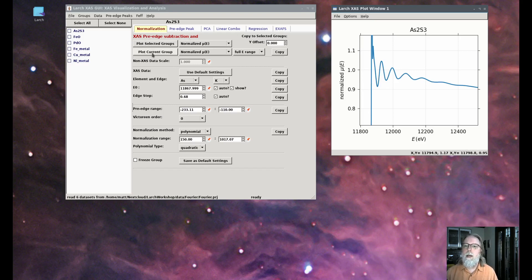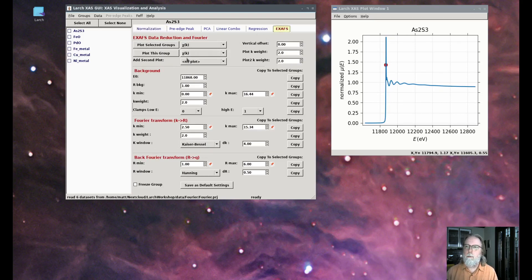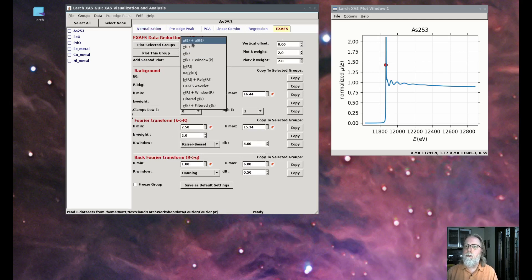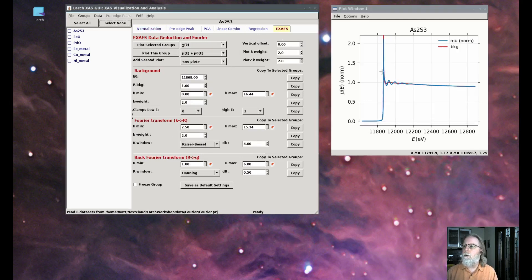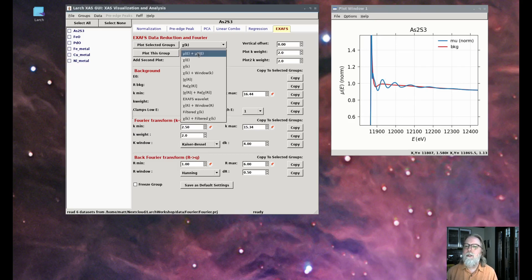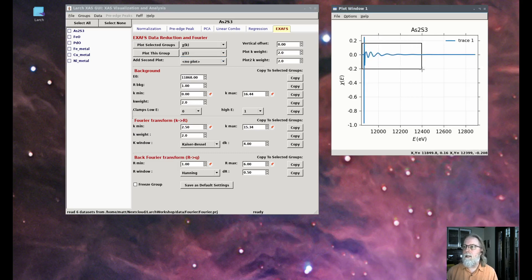Now that we have the data and it's pretty well normalized, we can go over to the XAFS tab where we'll work to do background subtraction and Fourier transforms. From here, we can look at the background subtraction. We'll show mu of E and the background that we would subtract. We're going to subtract the background curve from the mu curve and generate the isolated XAFS.